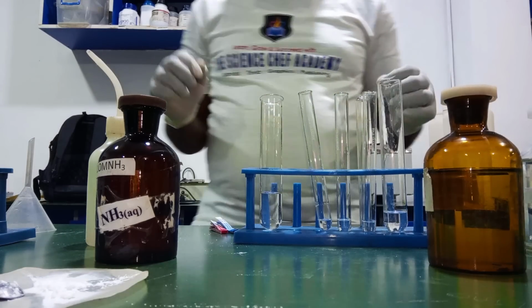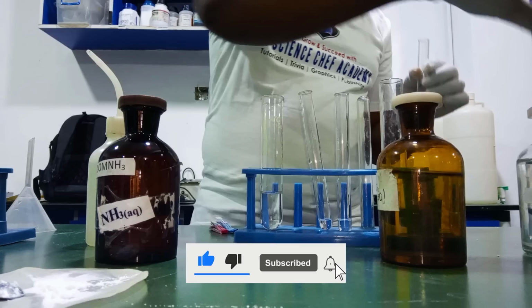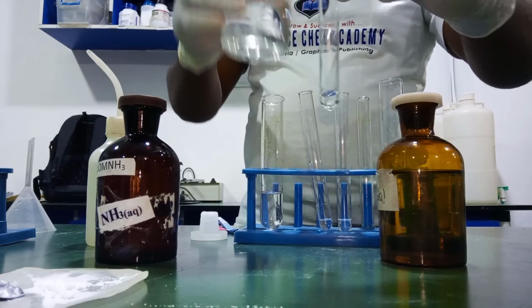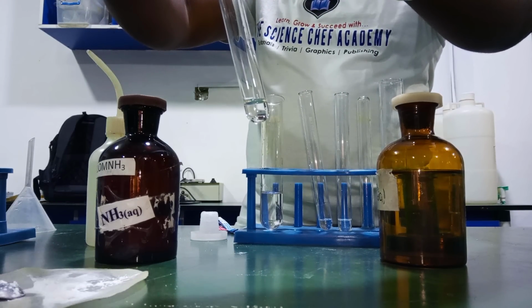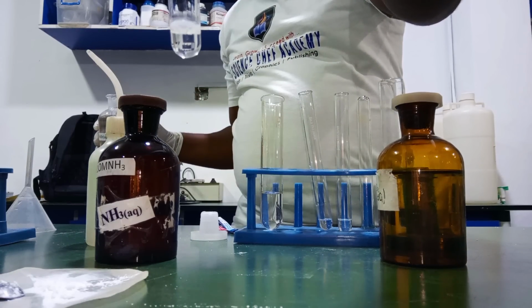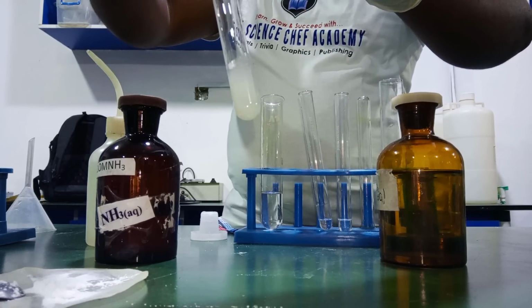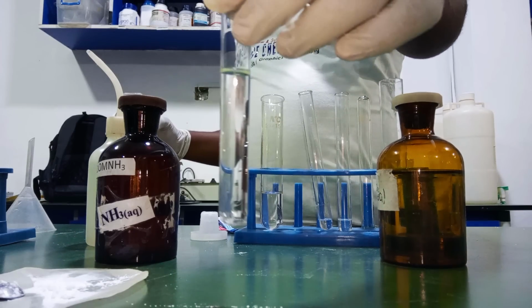All right. So to the first portion, we are going to add sodium hydroxide in drops, and we expect to get a white precipitate. Can you see? White precipitate in drops. And we now add in excess. We expect this precipitate to dissolve. Wow, it dissolves to give us a colorless solution.